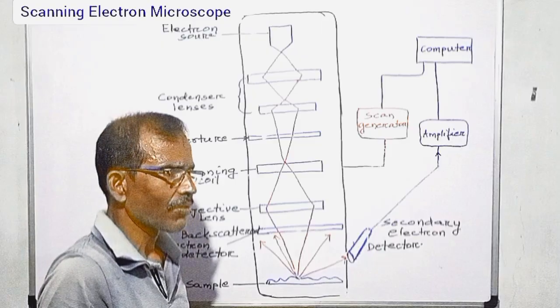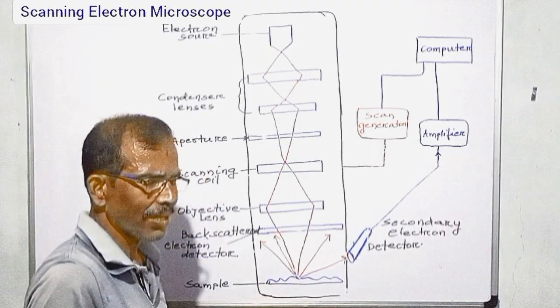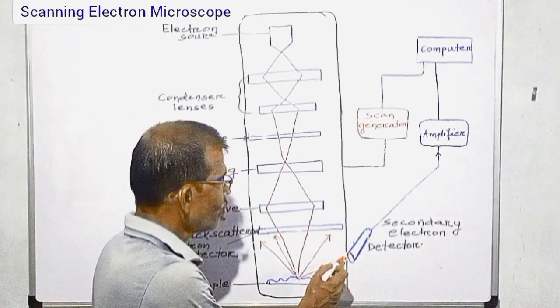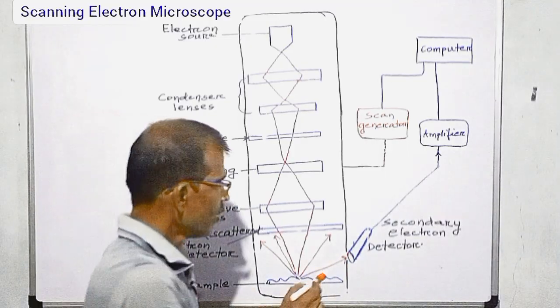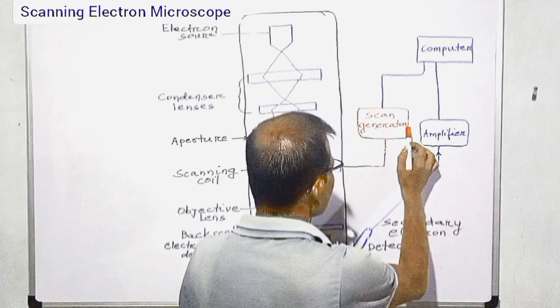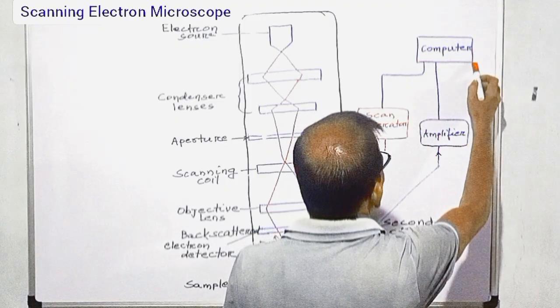Secondary electrons are of low energy. Because of this, electrons deep within the specimen fail to escape. Only the secondary electrons that are emitted from the surface reach the detector, which is then converted into a weak electrical signal. The signal is then amplified into a strong readable voltage, which is used along with the positional data to form a detailed three-dimensional image of the surface topography.